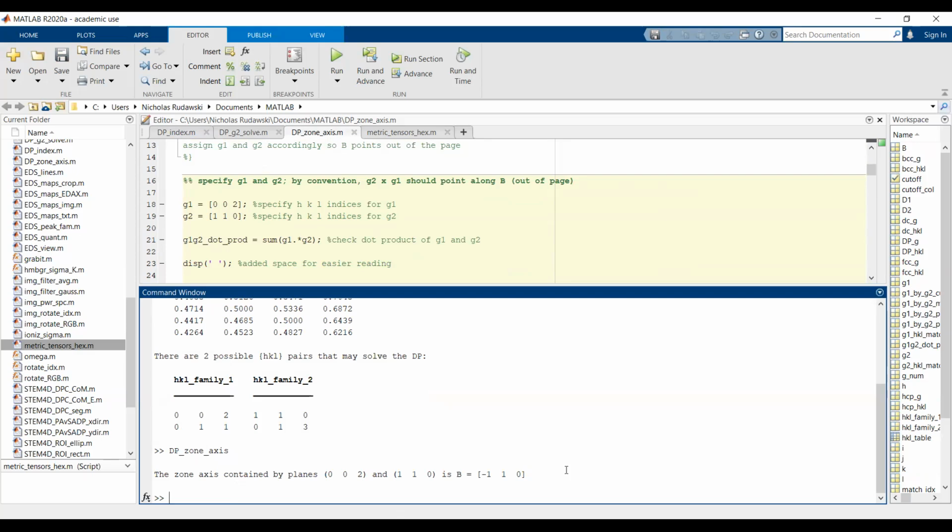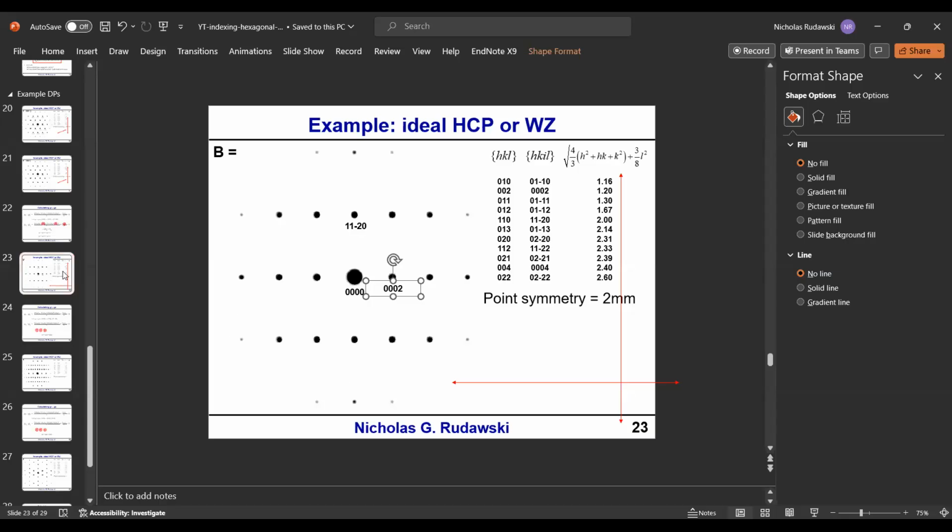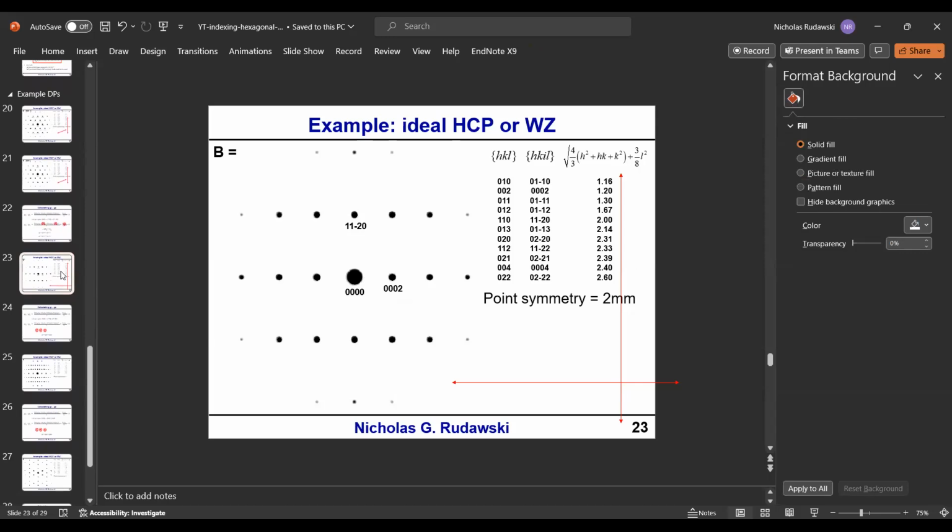Now we have to convert this to a direction. We have to use the formulas here to do this. So we have to come back here. And if I have a piece of paper here. Where'd my pen go? I thought I had a pen with me. I know the answer, but I want to do this correctly here. It's going to be hard to write with. All right, let's see if we can just do this mentally here.